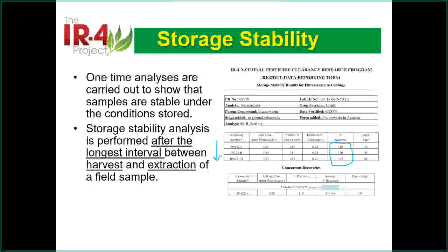Your preparation of standards may be slightly different. Maybe chemist A ran the analysis and chemist B spiked the storage sample half a year ago, so they use a different way to do it.